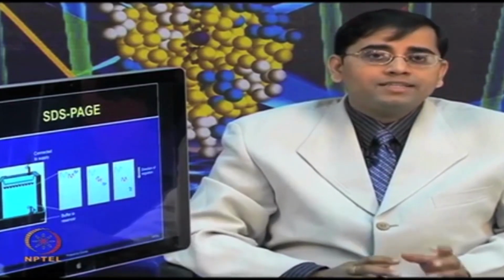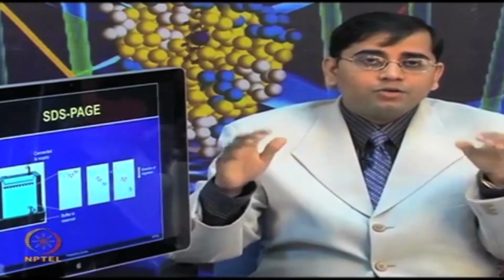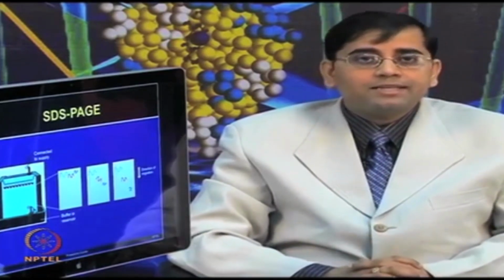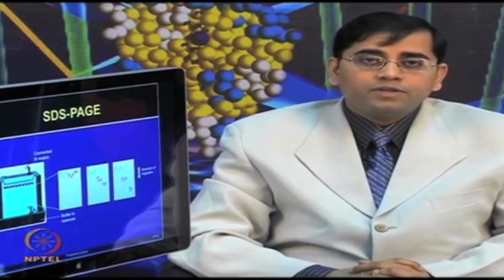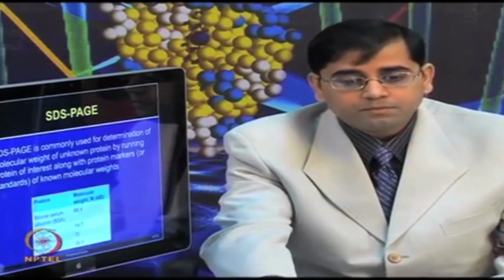I think it is important to clarify that in 2DE, when you use SDS-PAGE, you do not need to make these wells by adding a comb, because you already have a flat IPG strip which has done the first dimension protein separation. So, in this case, you need to make a flat well, so that your IPG strip can be placed on top of the SDS-PAGE gel. Again, to remind you, here you are only making the resolving gel for better resolution and separation of the protein. The stacking part is not done for the 2D, which has already been done during the first process of IEF.